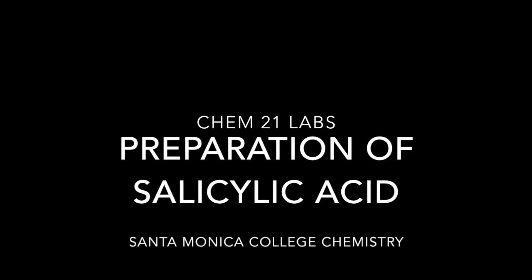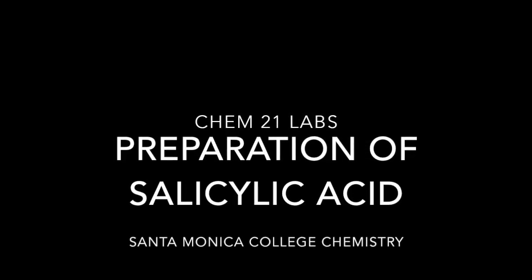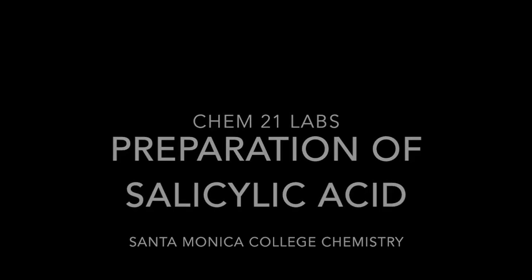Welcome back to CHEM 21 preparation of salicylic acid. In this second video we will focus on the reflux period and the isolation of the crude product.